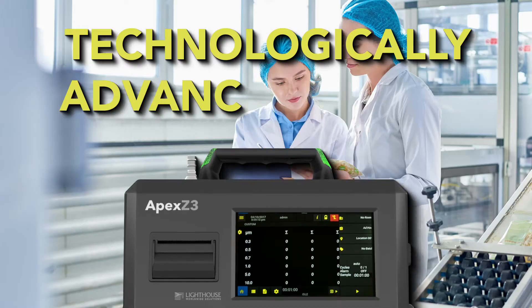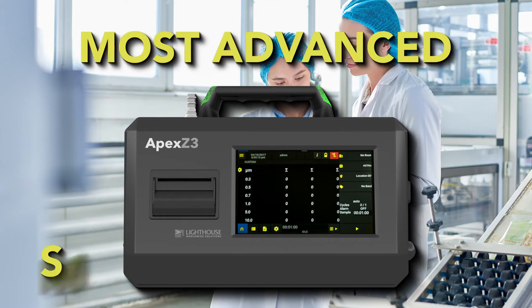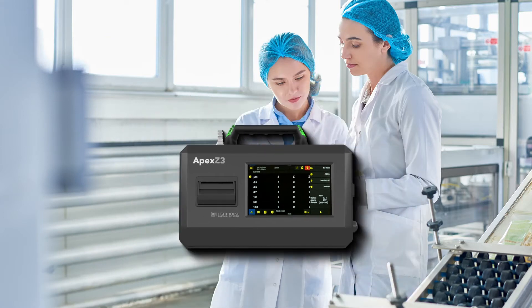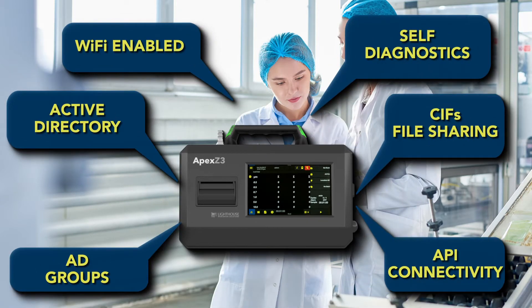Imagine a particle counter that tells you something is up. We have the most advanced smart technology, and there is more. Not only is the Apex Z small and light, but it is packed with technological features to enable simple and efficient connectivity so your data can be digitally stored and retrieved.